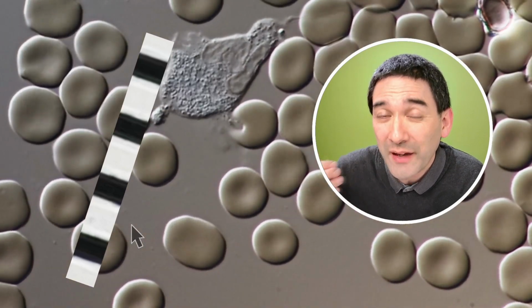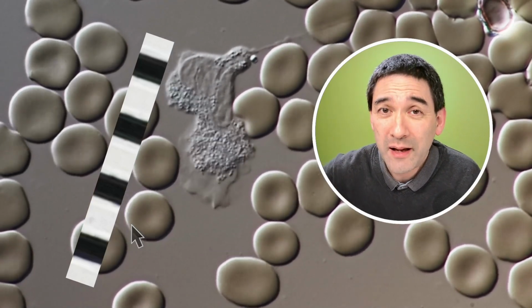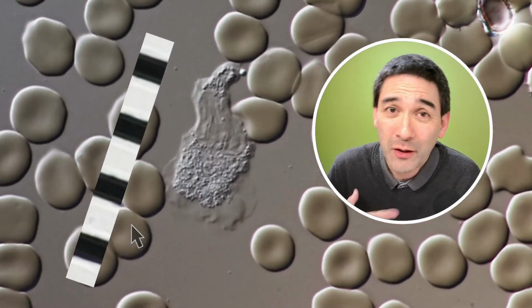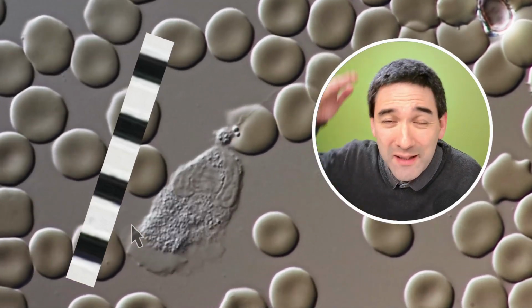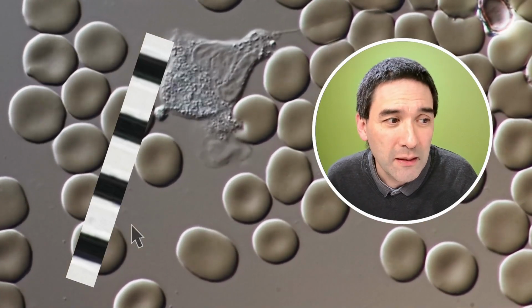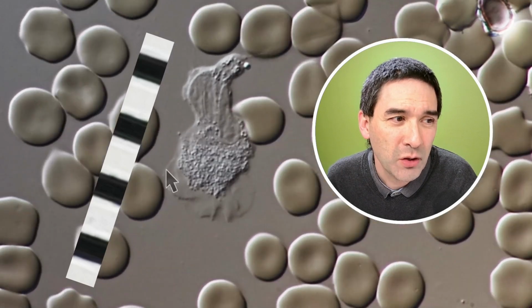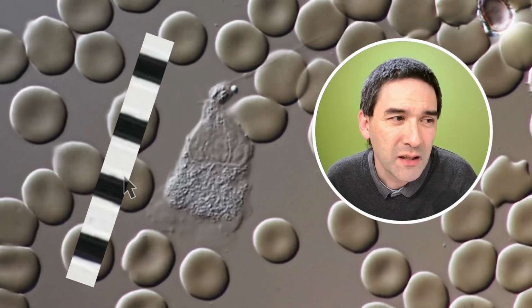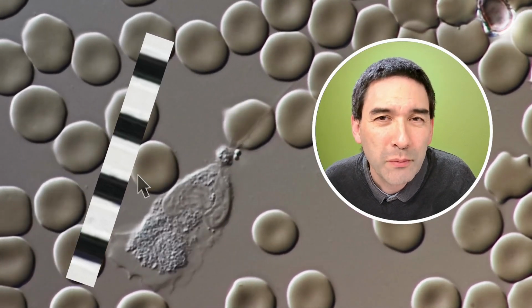But the real question now is, if the white blood cell had my size, how fast would that be? So we've got to scale it up. How many times larger am I compared to this little white blood cell? All you have to do is divide my size by the size of the white blood cell. Over here we see it goes from this black line maybe to the next black line. That's 20 micrometers. Let's just assume that it's approximately 20 micrometers in diameter.